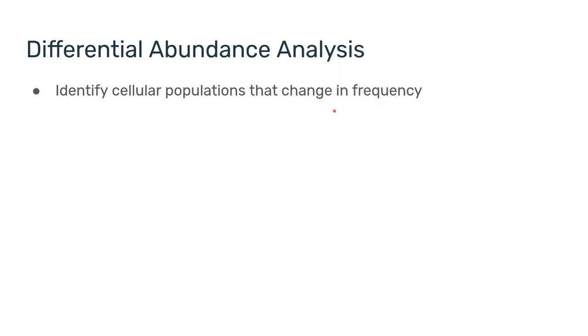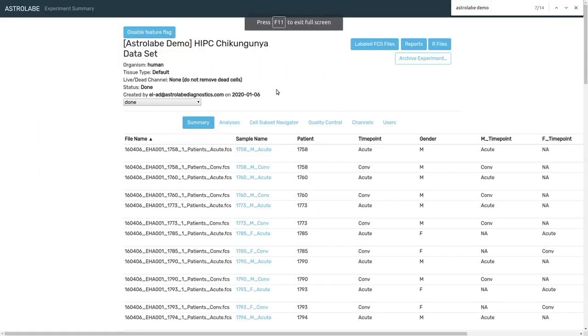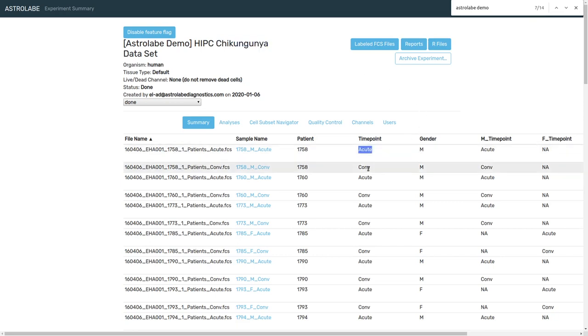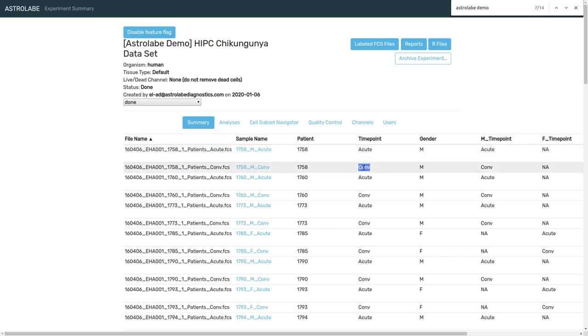And let's look at one example using the Astrolabe platform. This is an immune monitoring study of chikungunya infection and for the purpose of this demonstration we have two different time points, acute and convalescent. And we would like to see how the frequency of the different cell subsets vary across these two time points in the 42 patients enrolled in this study.